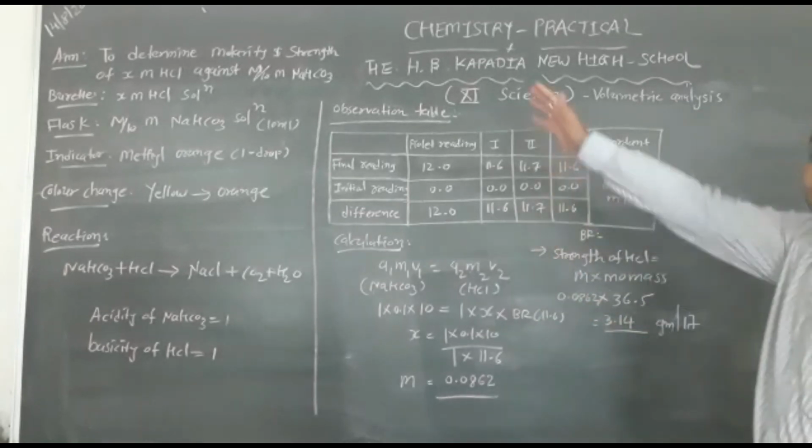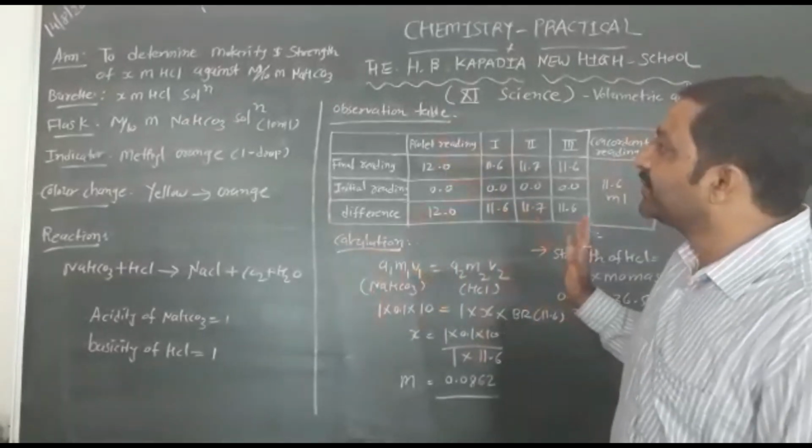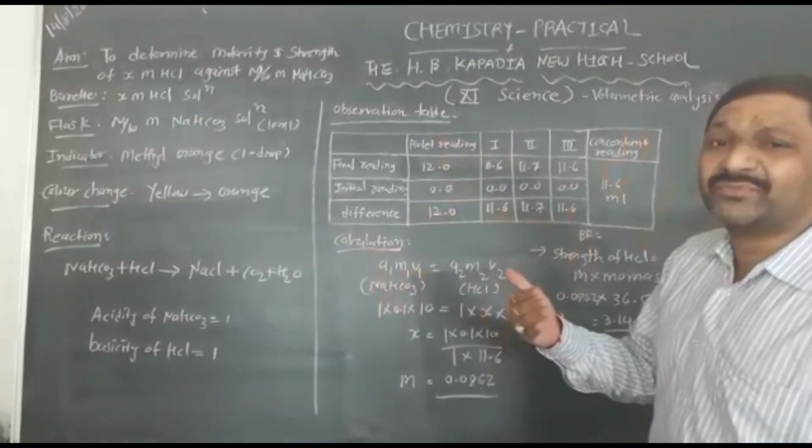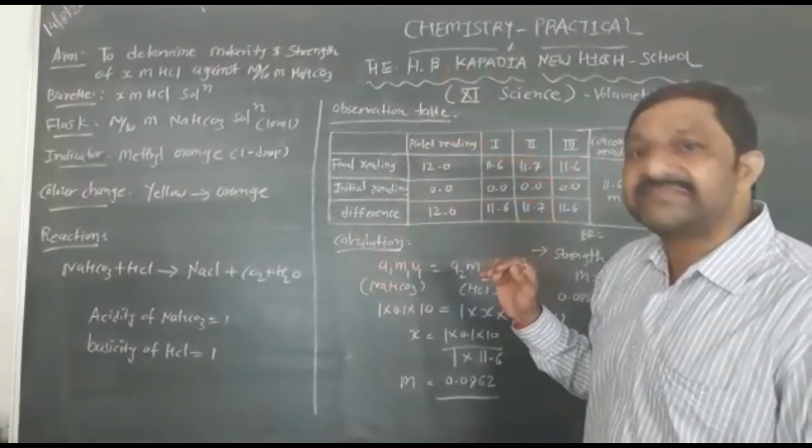So here is your methyl orange practical again: X molar HCl against M/10 molar NaHCO3 solution.